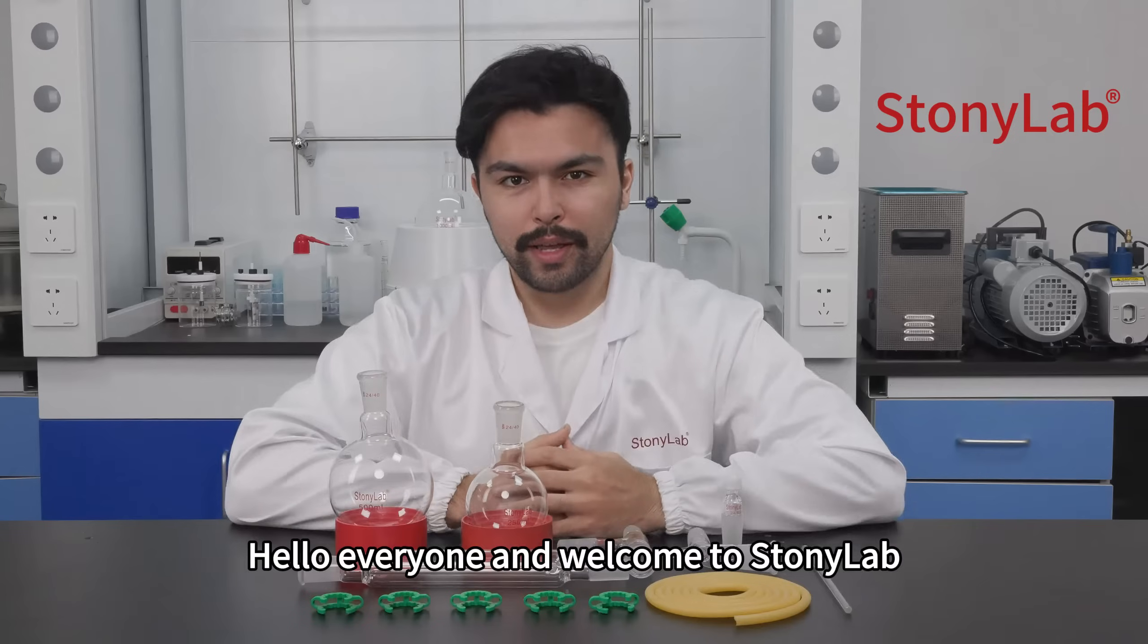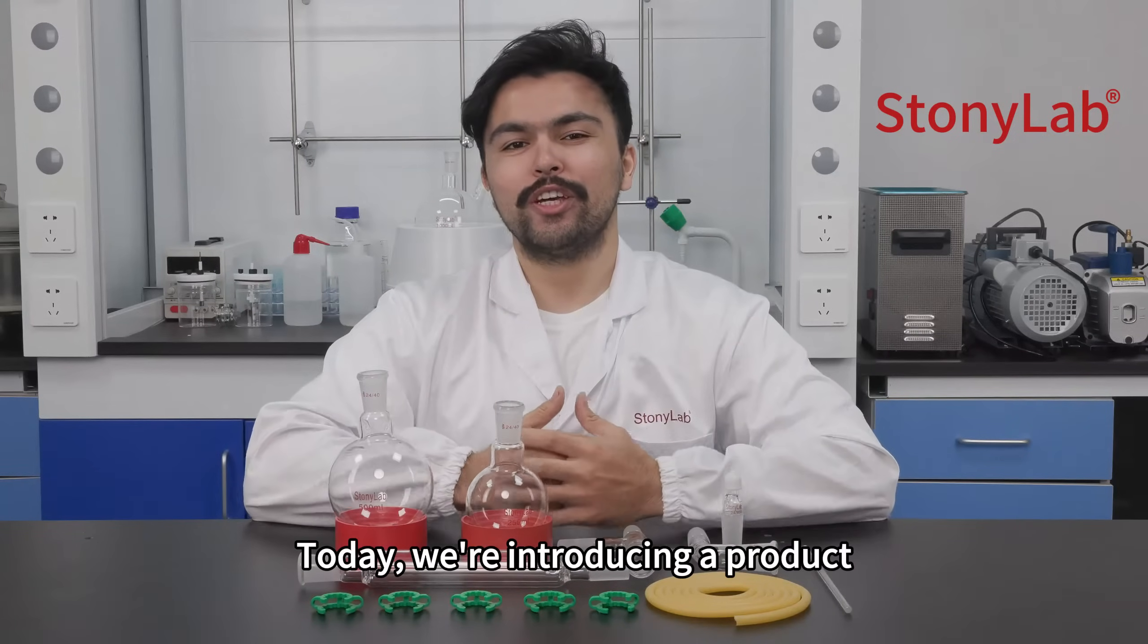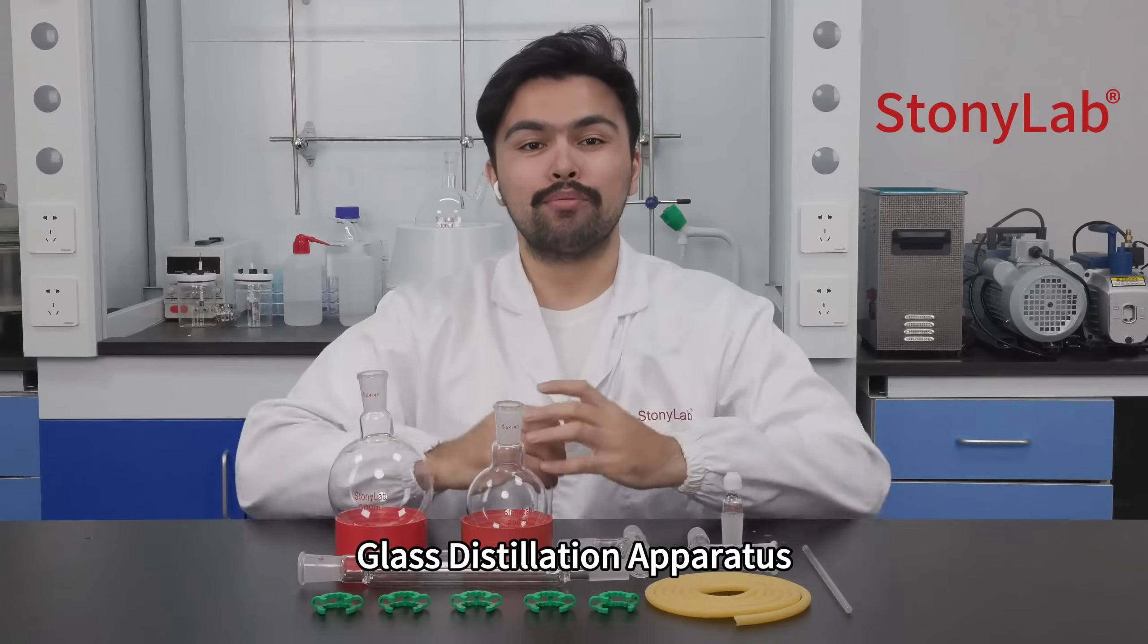Hello everyone and welcome to StonyLab. Today we're introducing a product: Glass distillation apparatus.